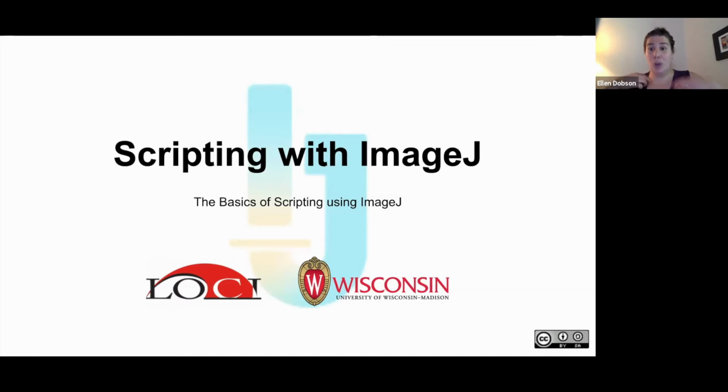Okay, that's good. I'm going to go over some of the basics, because if there are a few of you who've never coded before, it's important to go over. For those who are more advanced, you can play around with the code a little bit on your own. If it gets a little boring, I'm sorry, but there are links in the slides for you to check things out. But I want to make sure we're definitely covering the people who have never scripted before.